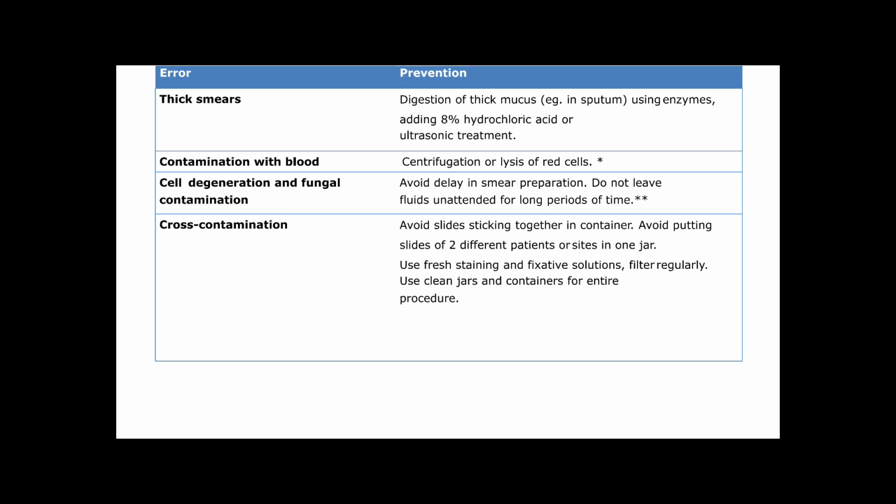Therefore, when the sample is centrifuged with this material, the red blood cells will go to the bottom and the diagnostic sample of cells will be suspended in the medium above the red cells. So we can easily collect our sample.